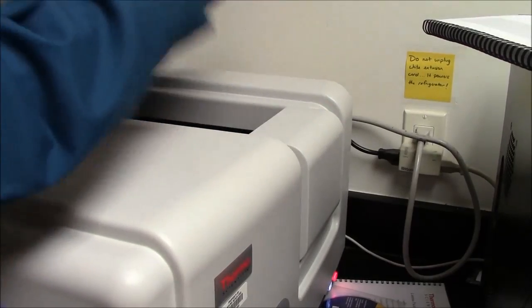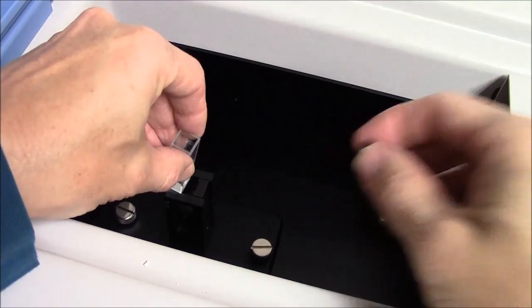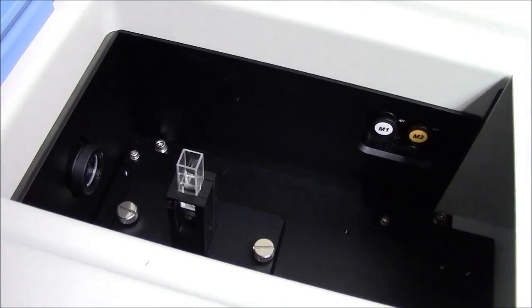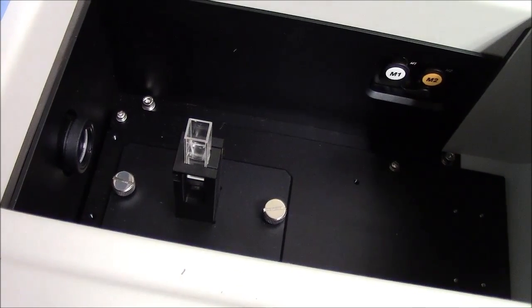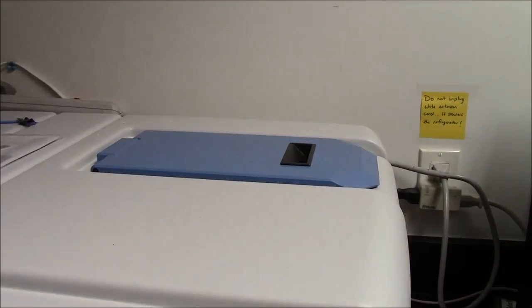The chamber opens here. Inside is a compartment where the cuvette will rest. It doesn't push all the way in as it does in a spectrophotometer. The light source is right here. You can't really see it. The light detector is right there. Close the lid before taking any measurements.